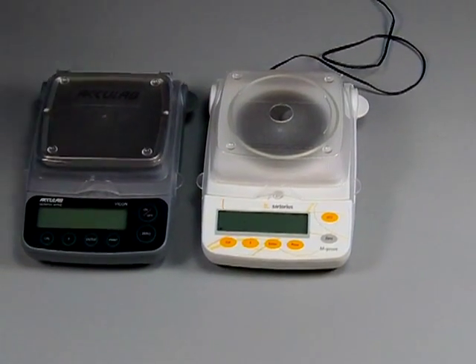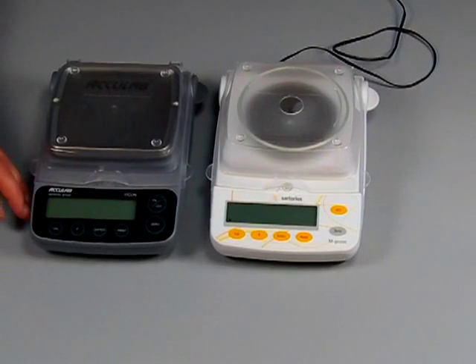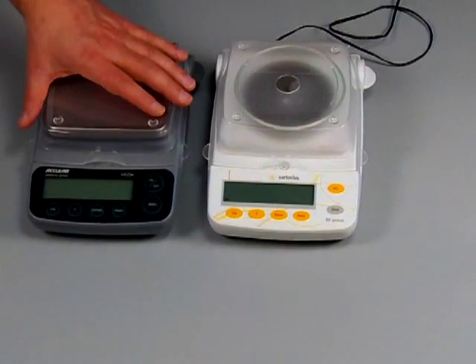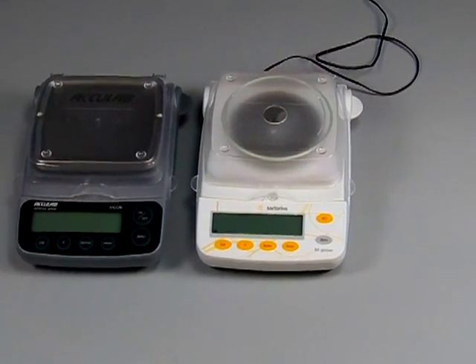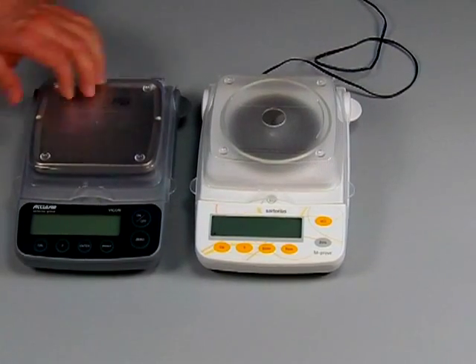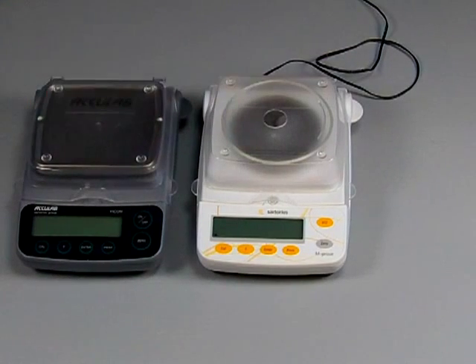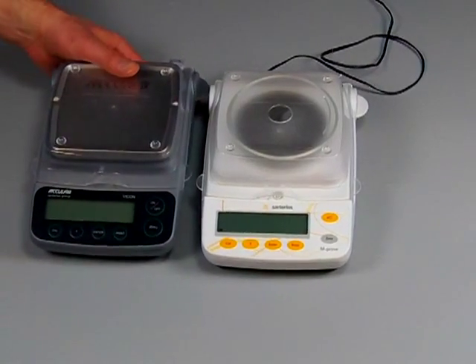These are the marketing geniuses that figured changing the color enables you to raise the price. AccuLab is no longer around. They basically in their restructuring shut down the AccuLab brand and now have replaced it with the new Sartorius AY series, part of the M-Prove line. I just want to show you they are the same scales.